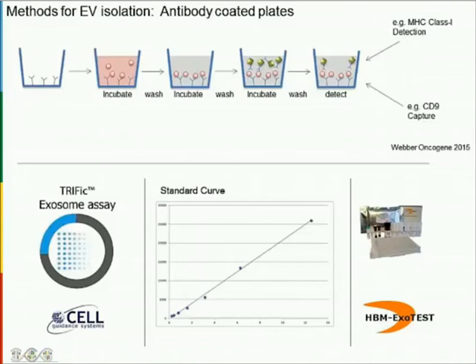However, with our ELISA and these commercial ELISAs, what we really need is a good standard curve, something that's been independently certified as a really good quality exosome preparation. At the moment, there's a little bit of an elephant in the room in that we don't have anything of the kind. So accurately quantifying exosomes with an ELISA-based approach is still challenging, simply because we don't have a suitable standard in the field. I'm sure that will come in the next few years.